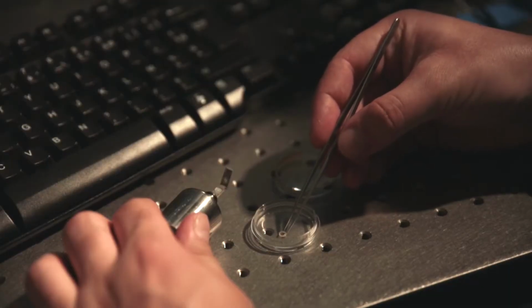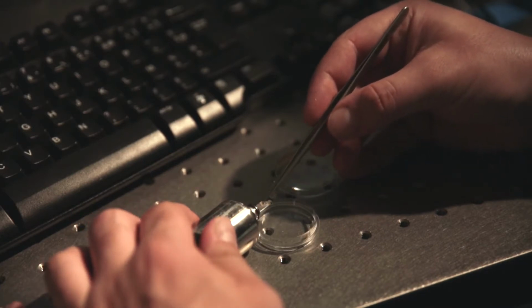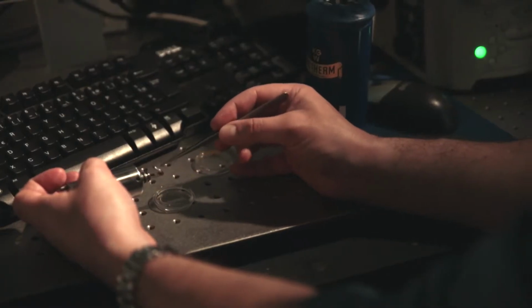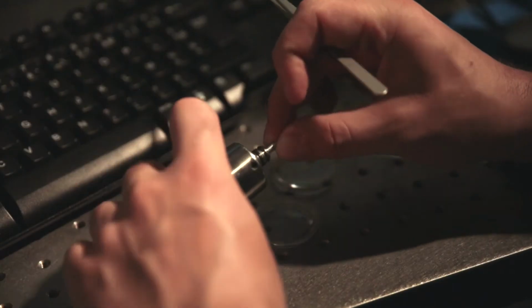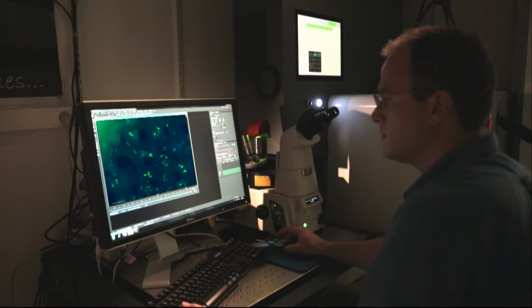For that, we developed a new method centered around the CryoCapCell, which is a technology I invented during my PhD, that allows us to follow a structure which is located according to landmarks, and at a given time take the whole sample and transfer it into a high-pressure freezer that will vitrify the specimen before preparing it for electron microscopy.